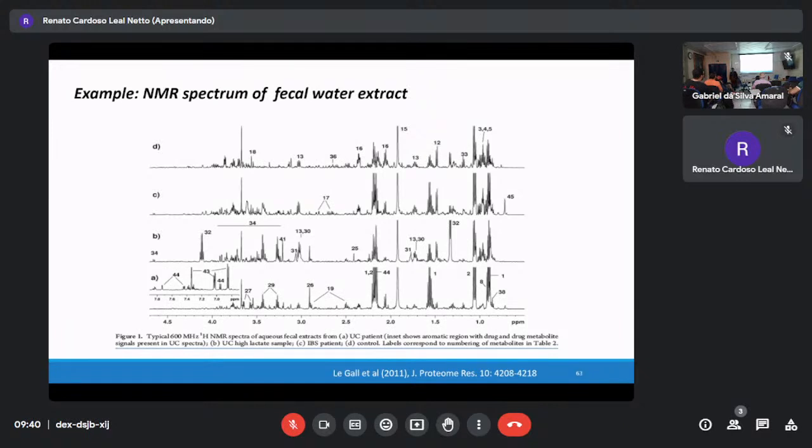But if you take out the protein, the amino acids are still in the supernatant. As we see in the NMR spectrum, the chemical characters of amino acid and protein are different. But if you're looking for a pesticide in the milk, that is always a tricky case.